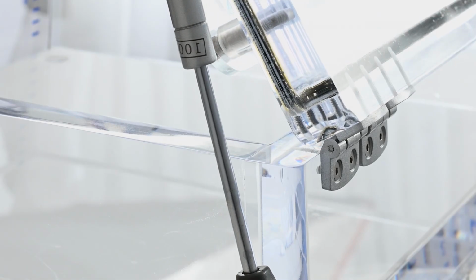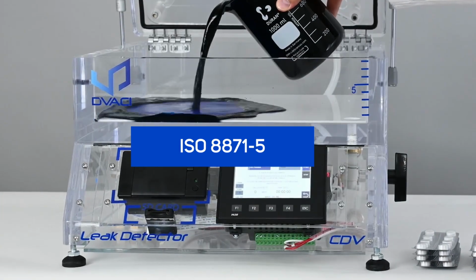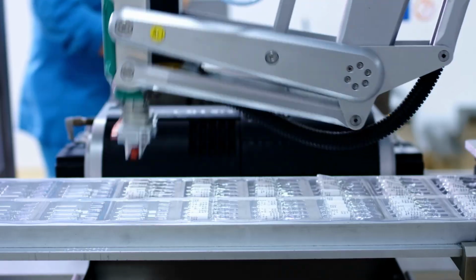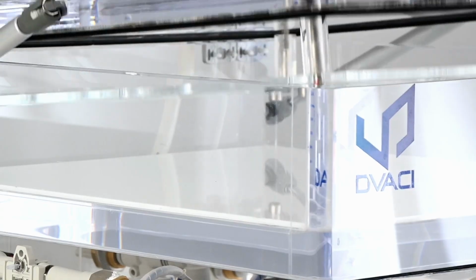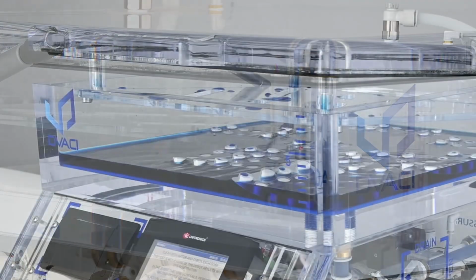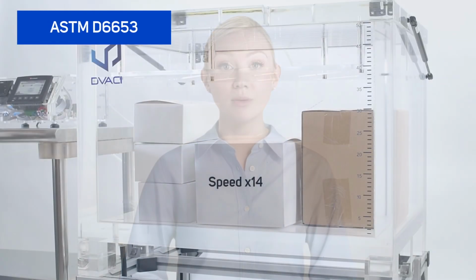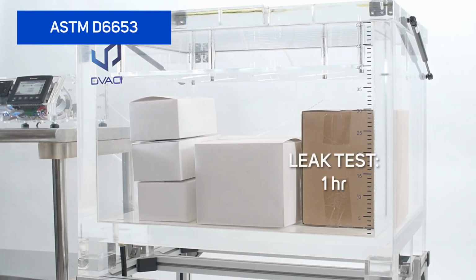For pharmaceuticals, we use a colored dye method compliant with ISO 8871 Part 5, involving vacuum exposure for 10 minutes followed by 30 minutes submerged at atmospheric pressure. So, a full test could take about an hour, including sample inspection. And then there's the altitude simulation test per ASTM D6653, where we adjust atmospheric pressure to simulate transportation conditions, requiring at least 60 minutes at the specified altitude for meaningful results.